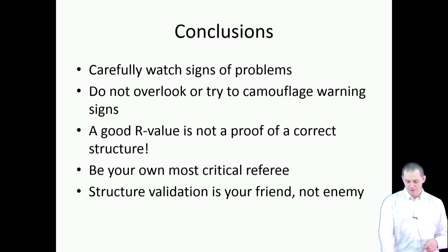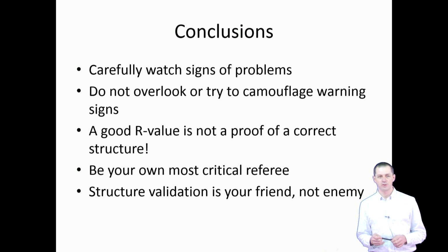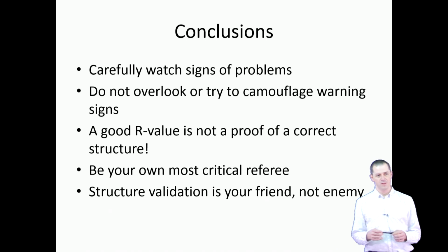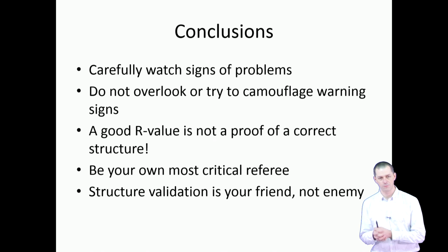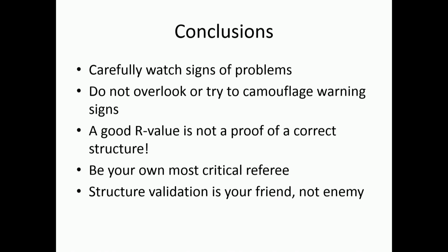And a final word, I haven't spoken much about structure validation. Structure validation is not included in Jana 2006, or at least not in as much detail as it is in the program Platon, which is the gold standard for structure validation for standard structures. And if you submit a structure to IUCr journals, so International Union of Crystallography, and also many other journals, you'll be required to submit a CheckCIF file, which is an output of a check of the structure with the program Platon, and there are a lot of checks being done on your structure.